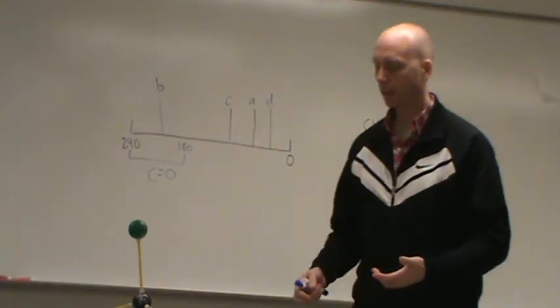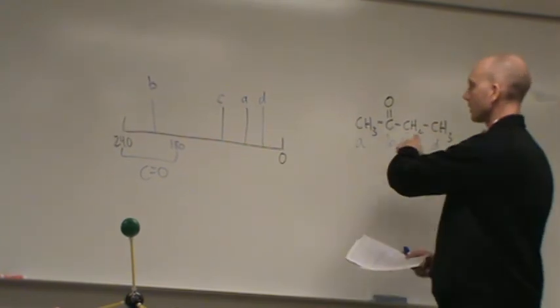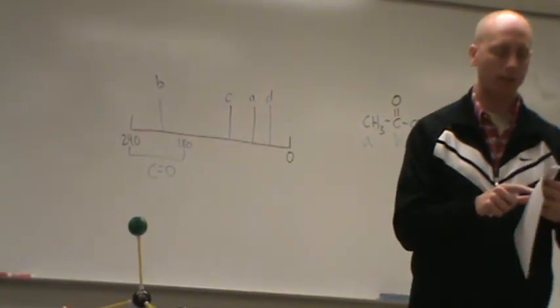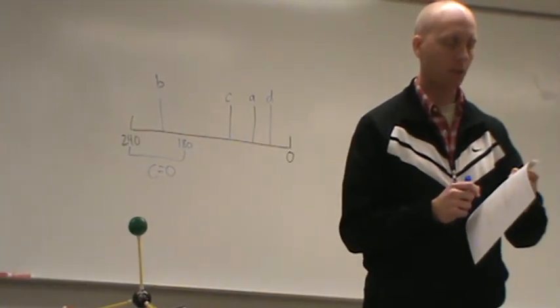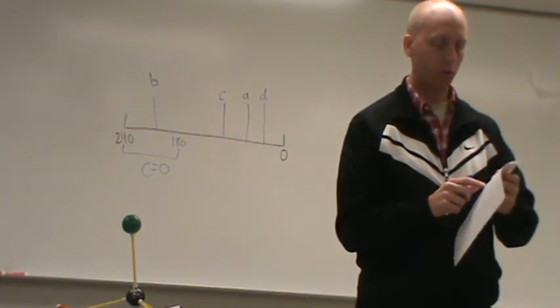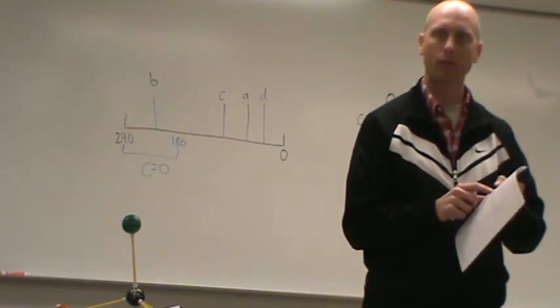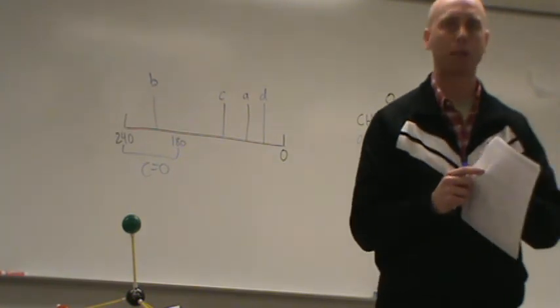So this one here is the same molecule we just looked at. See that? But here I wanted you to see something. You see the carbonyl peak? What's it shown as? 207. But is 207 on the spectrum? No, it stops at 200. Okay? So here, this is what's called an offset peak.